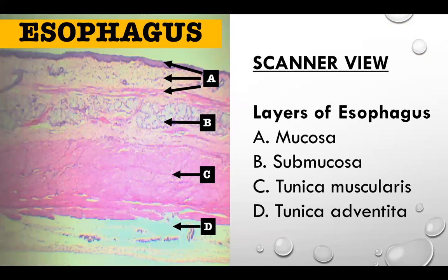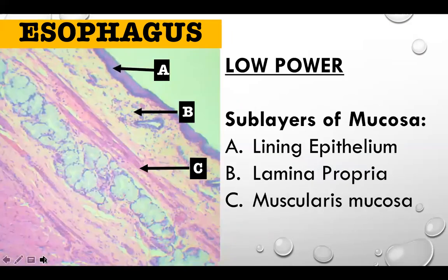Let's start with the esophagus. In the scanner view, letter A is the mucosa, B is the submucosa, C is the tunica muscularis, and D is the tunica adventitia. At low-power magnification, we can see the three sub-layers of the mucosa of the esophagus.